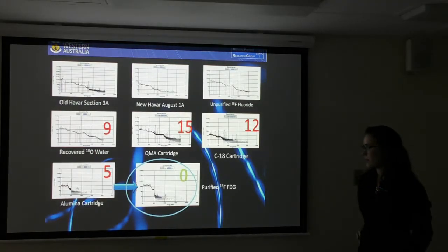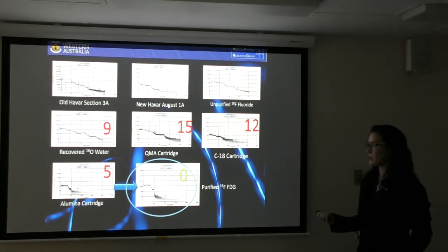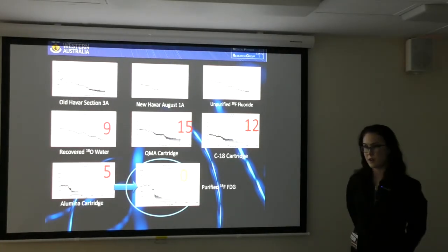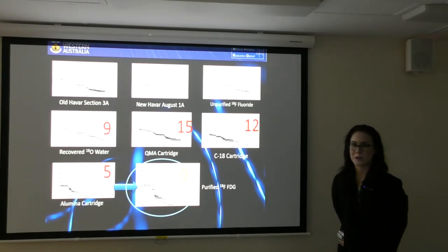This is from the iodine 131 pipes that run near the gamma spectrometer, and they were removed during the background subtraction. So again, we just have a nice 511 peak. This was also confirmed to be F18 by doing a half-life check on it as well, which I got 109.15 minutes. We want 109.7, so I would say that's pretty close.